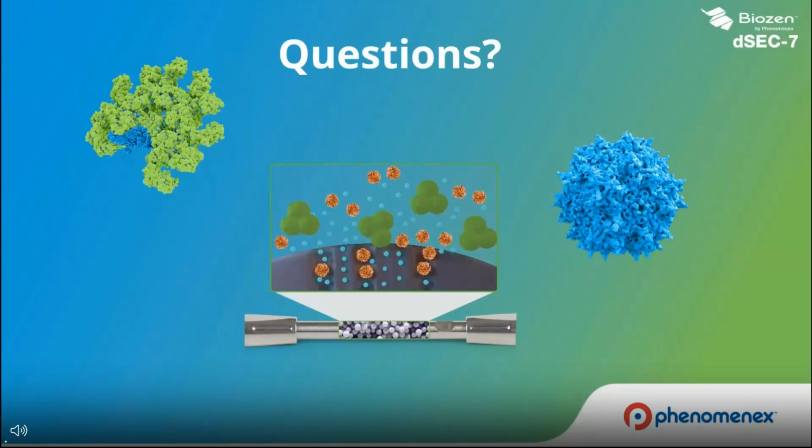The first question I have is, what is a good starting point mobile phase you would suggest for AAV aggregate analysis? Yes, Ram. The starting point, I would say, is basically the formulation buffer. Whatever it's running, and typically what I've seen the most is approximately 1 times PBS with about 0.001% Pluronic F68 inside. There's no problem with starting with this composition as your running buffer. Sometimes if you see that your AAV monomer peak, which is basically your main component, is not coming off, I would recommend quickly pushing the salt content, your sodium chloride, beyond 200, so something like around 300 millimolar, to see if you get better recovery from your column.